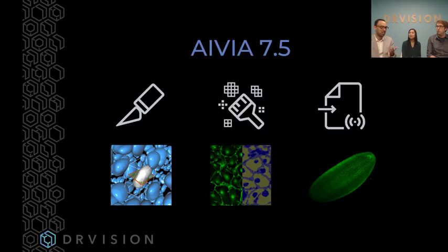So the formats are either multi-file TIFFs, so one TIFF per time point and then another TIFF for another time point, or multi-TIFF for Z, so lots of files for one time point, and then lots of files for another time point. We have the nomenclature that is ideal for us, but Aivia is actually very flexible in fetching the nomenclature from the file name so that it knows what the sequence is.